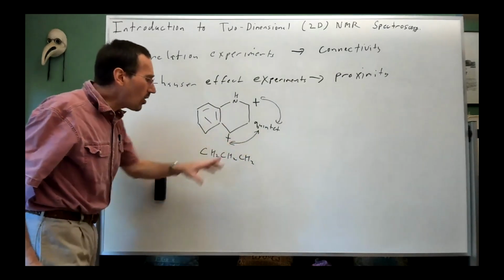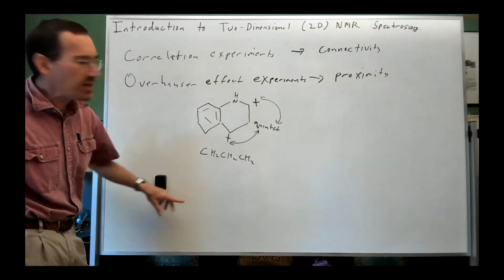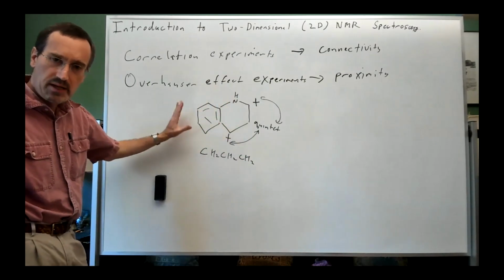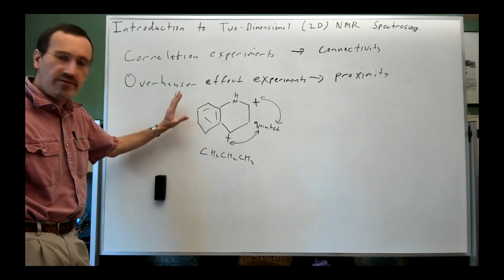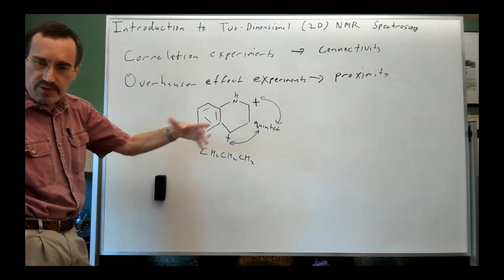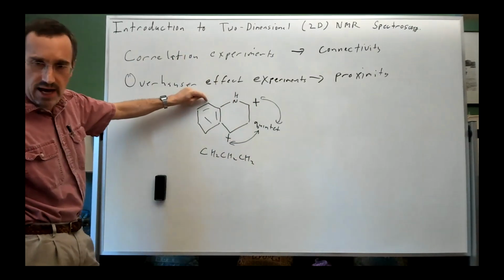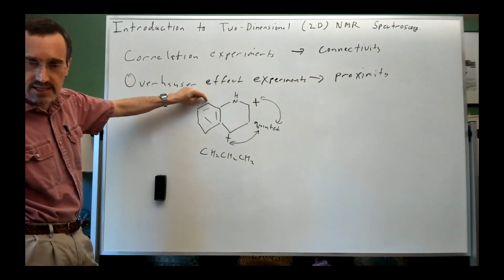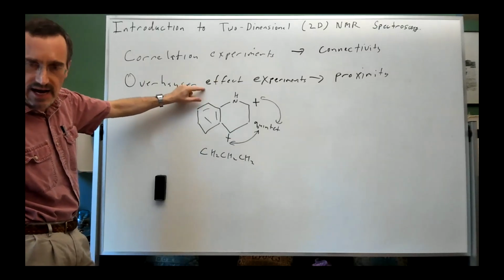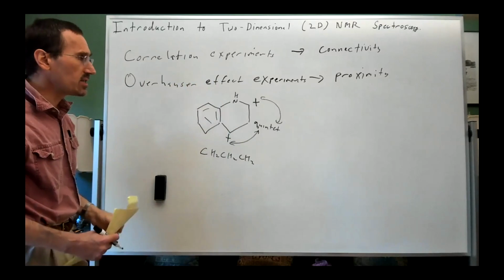Well, a COSY experiment is going to give the same type of information, but without having to use this type of inference. So it's another way of building up this type of experiment of connectivity. People have also in the DEPT experiment been able to say, oh, that's a carbon in the aromatic region with a hydrogen attached, because it's a CH group. So they were able to infer that these carbons had hydrogens attached, and that's going to be our HMQC experiment.